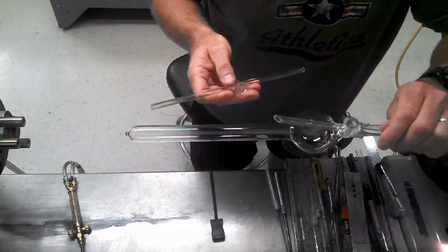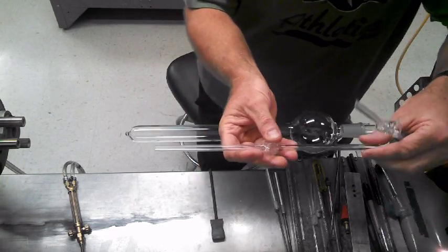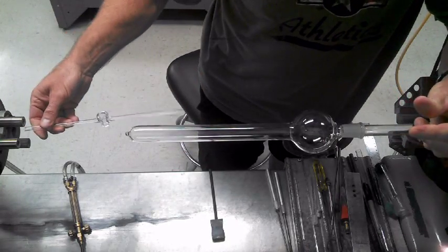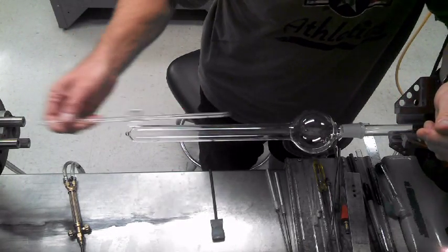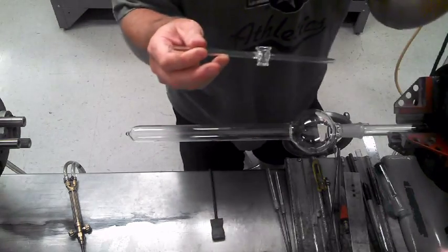Here's a little tip I have for installing stop cocks on a chrome target home. Usually what people do is they take the regular stop cocks and install it onto their piece, then they take the piece out, let it cool, go over to the saw, cut it off so it looks like this, fire polish it and throw it in the oven.